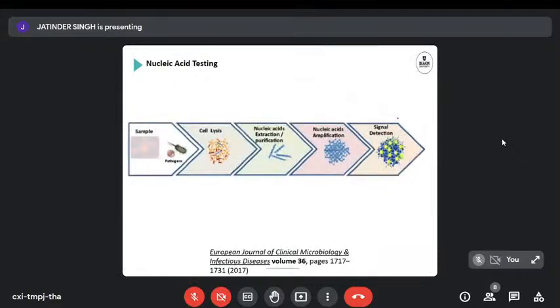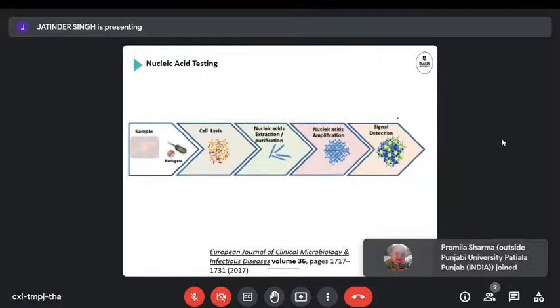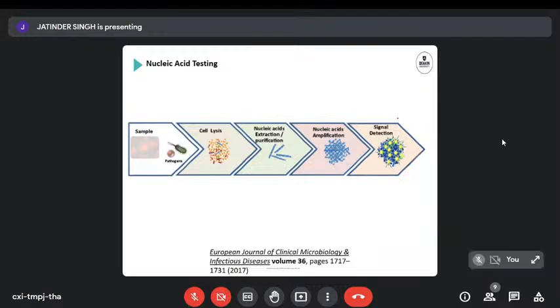So we can break up cells. We have a similar kind of toolkit for conducting cell lysis on a microfluidic device as we already have on the bench. We've got options that are mechanical. We have options that are chemical. Mechanical needs a more complex setup, but doesn't add any chemicals. If we do add chemicals, we may also have to introduce an active or a passive way to mix the lysis reagents in our sample.